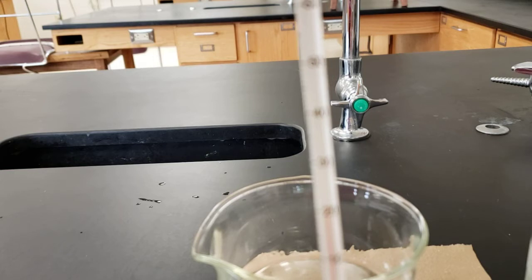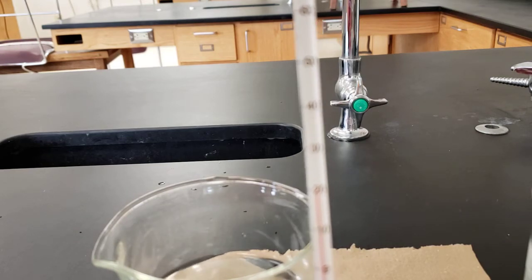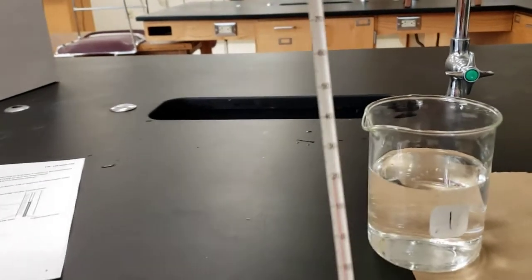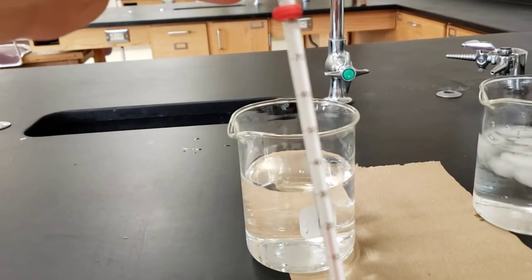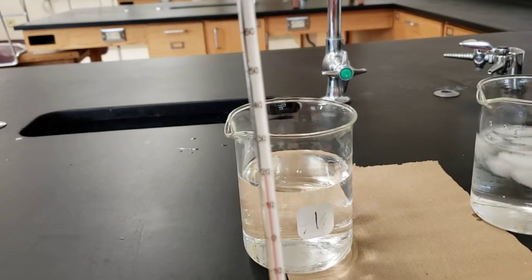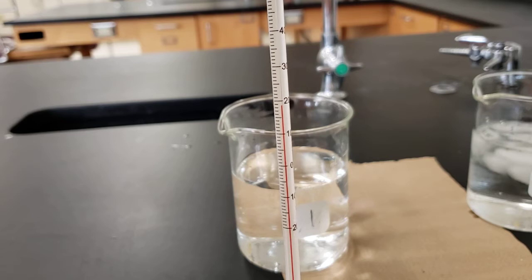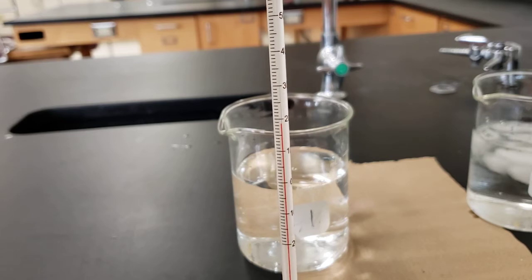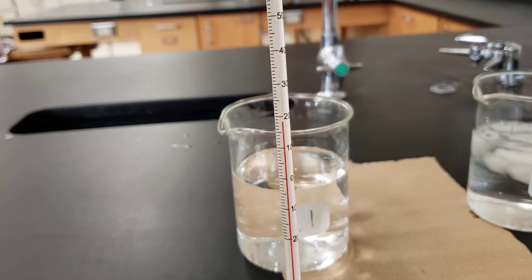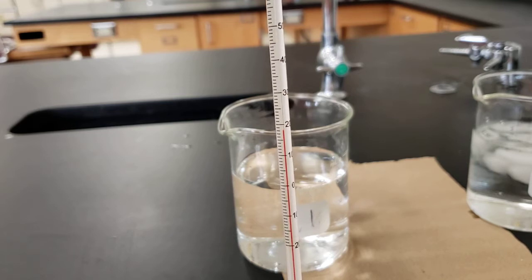Okay, I'm just going to bring the thermometer out, hold it right up to the camera, and then I'm going to let y'all just read off of that. So just pause your video once you get to this point so that y'all can read that. Oh, I think I messed up the focus on this. There we go. Great, so go ahead and read that temperature off there. And just remember, try to get it to the nearest whole number.